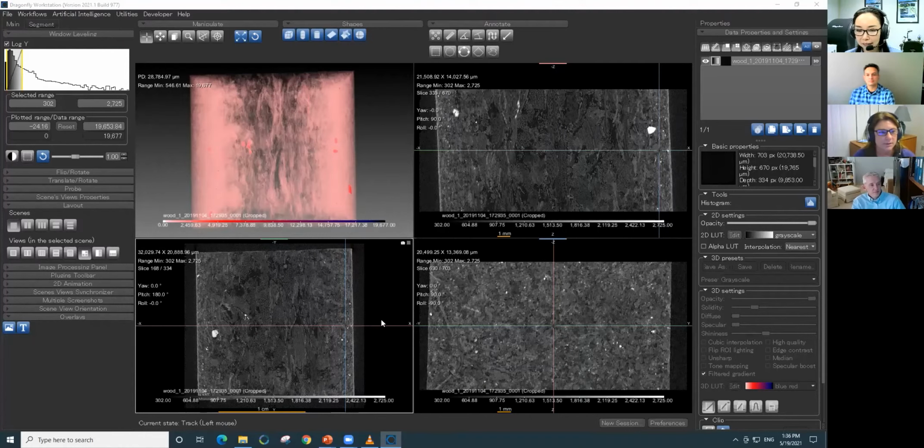Let's do it, Angela. All right, so I've launched a poll here so you can vote on how you might recommend approaching this. Would you separate the volume into multiple thin volumes, or would you run a slice analysis on the wood segment, or would you draw a line through and look at the profile of that line? Which one would you do? We'll give you a few seconds to answer. It's fairly even, but there's one eking out in front. So maybe a couple more seconds. And then I'll end the poll and share the results.